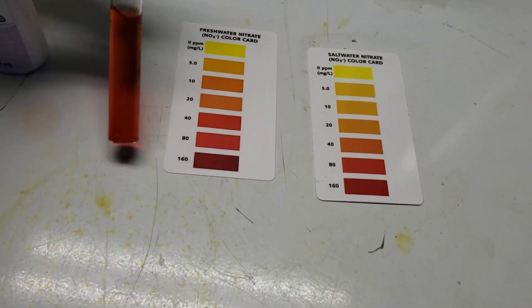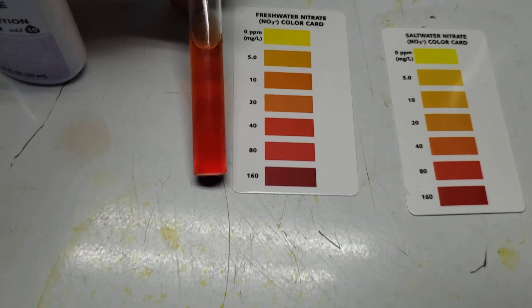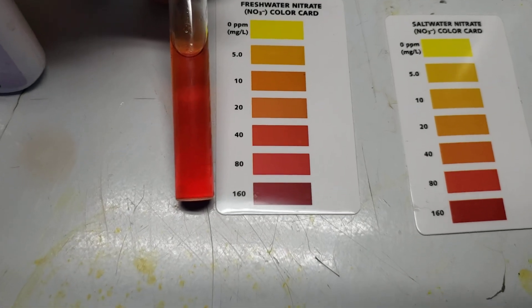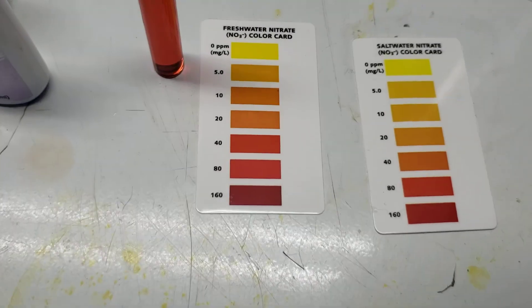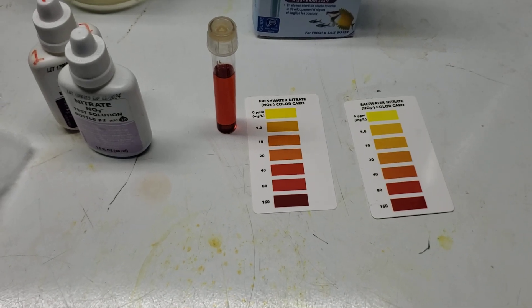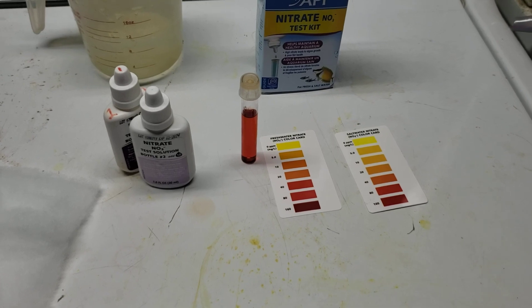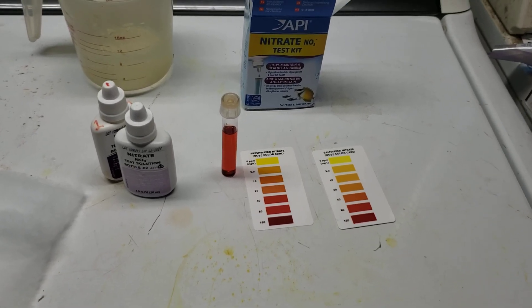In this particular example, to my eye, that is not quite as red as the 40 parts per million, but it's definitely more red than the 20 parts per million. So where would you put that? The answer is: who cares? It's somewhere between 20 and 40 parts per million, so we could round it to 30, or even round it up to 40. It's just not a number that really needs to be that precise. It's just there to give you an idea of what's going on in the tank.